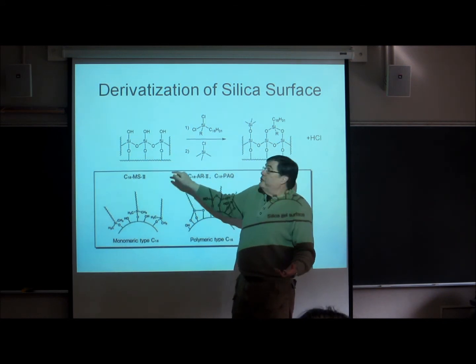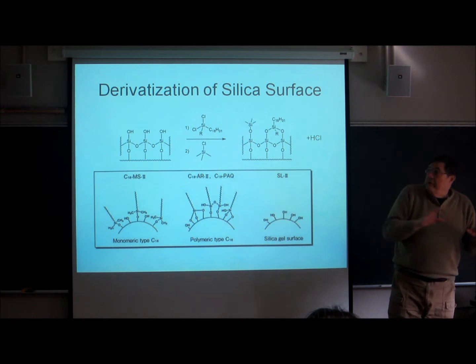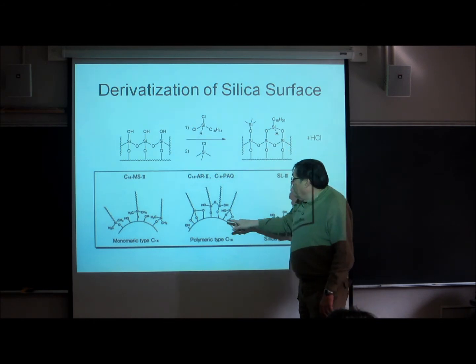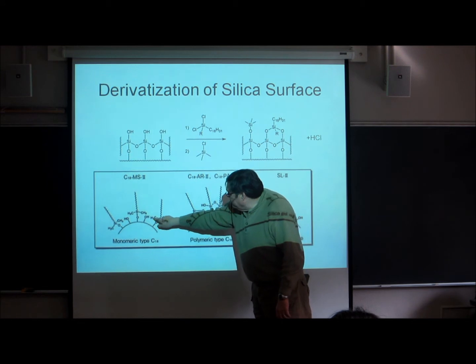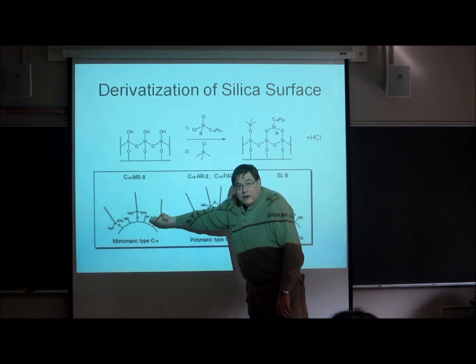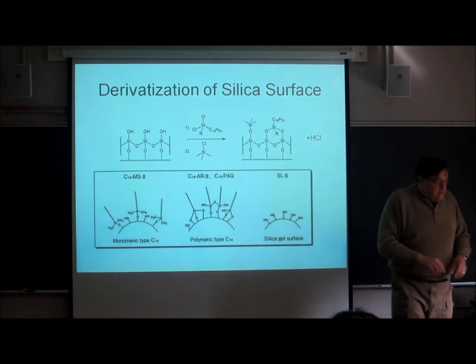In the finished product, there's still going to be SiOH bonds, but we hope to protect the surface from them by having these other groups bonded. Now remember that 2 methyl groups on this silicon here will also help shield the surface hydroxides. Here we see the methyl group helping to shield this one so that adventitious molecules coming in may not be able to get down to that hydroxide very easily. They're kind of kept away from it. So there's this shield defense. All right.